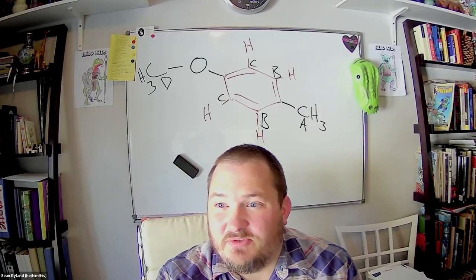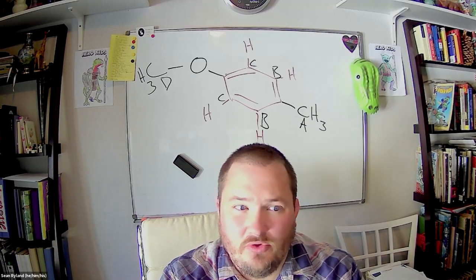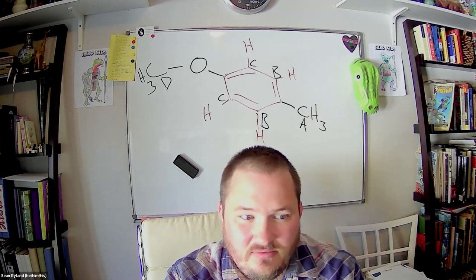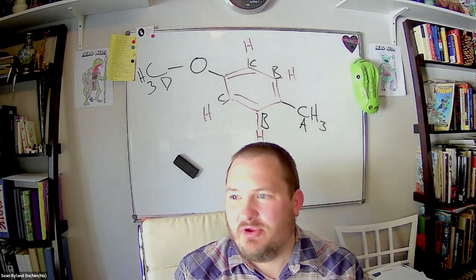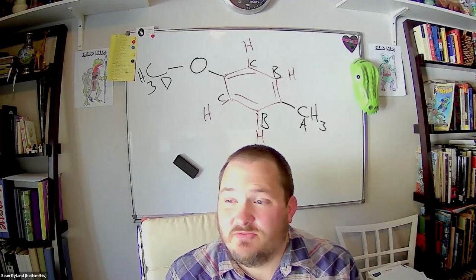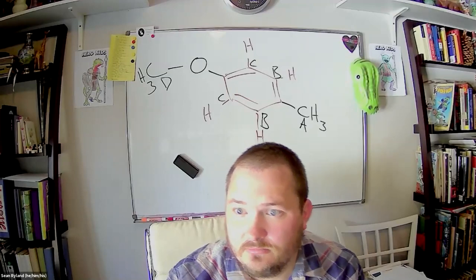Sean, on 67, on the carbon NMR, what's the deal with that solvent? Sometimes based on how we made something or what we have to do to get it to dissolve, because NMRs only work if they're in liquid or in a solution, the solvent can't get rid of it entirely. But if you know what your solvent is, you can say, okay, I know that acetone always has these three peaks show up in a carbon NMR, and you just label them as being solvent and ignore them. So the fact that it's a solvent just means it's not part of the molecule you're looking at, but you don't have to do anything with them. Okay, so for 67, we're only concerned with five carbons. Bingo.